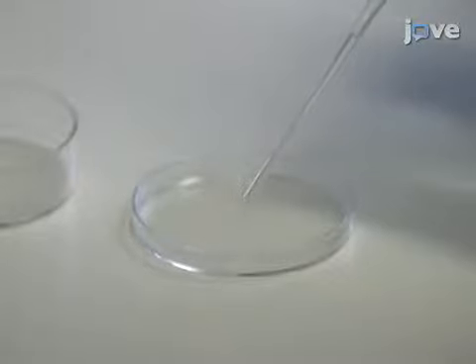Then generate pairs of PSM explants by dissecting the tail tissue into two halves along the midline, using a gentle rocking motion with the needle. Ensure that the neural tube, notochord, and PSM tissue are equally divided between the two explants.